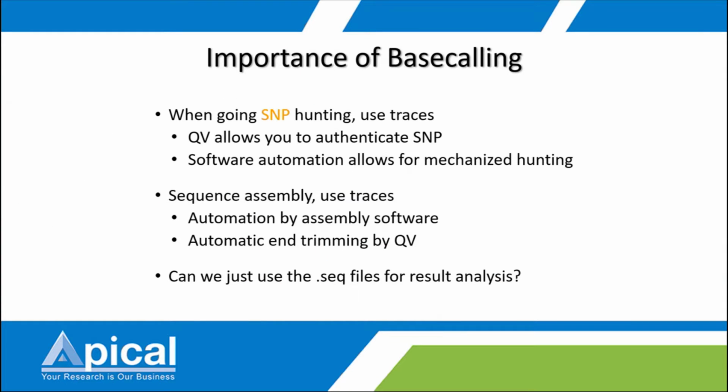The important thing about base calling is that it will help you to know which sequence you can trust, which bases you can trust, and then you can choose them for further analysis. You need to choose all these trustable bases for your result analysis, for alignment, for BLAST later on. So base calling is very important. Also, you can determine your SNP. If you are studying SNP, then you can determine the SNP very easily from the result.